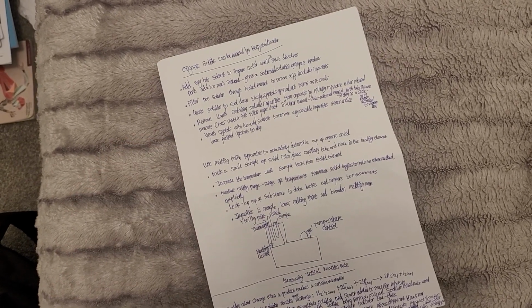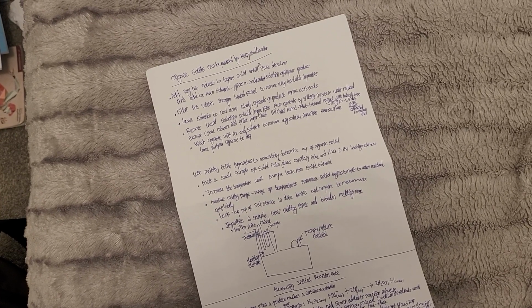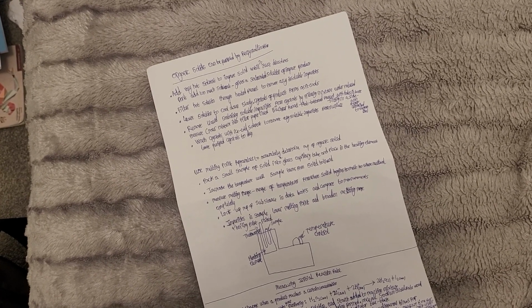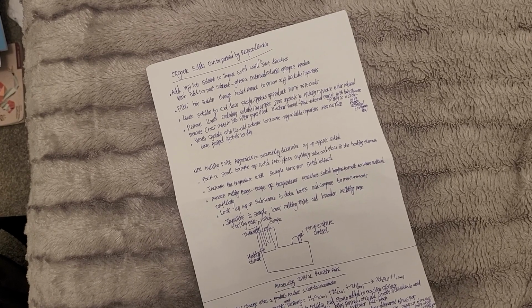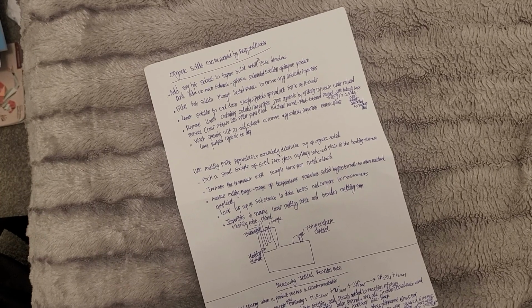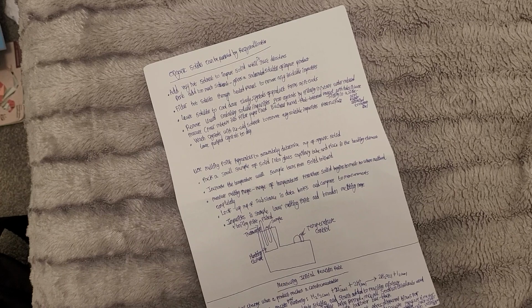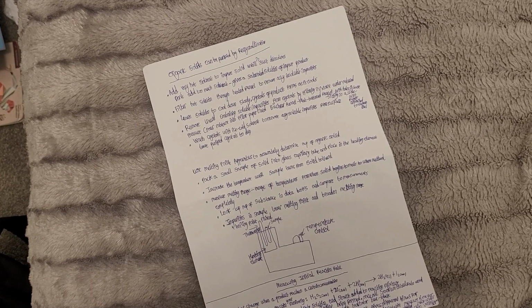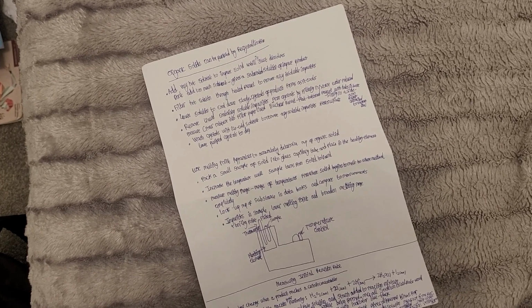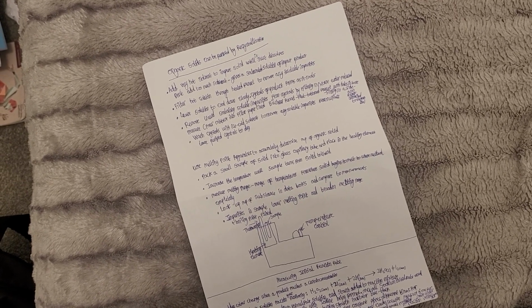How to use melting point apparatus to accurately determine the melting point of an organic solid. Pack a small sample of solid into a glass capillary tube and place it in the heating element. Increase the temperature until the sample turns from solid to liquid. Measure the melting range, a range of temperatures from where the solid begins to melt to where it has melted completely. Look up the melting point of the substance in data books and compare it to your measurements.